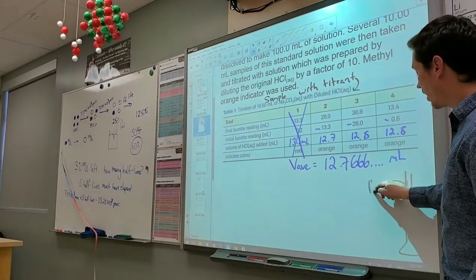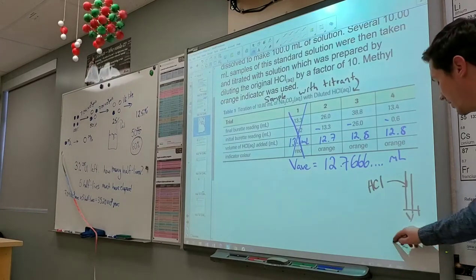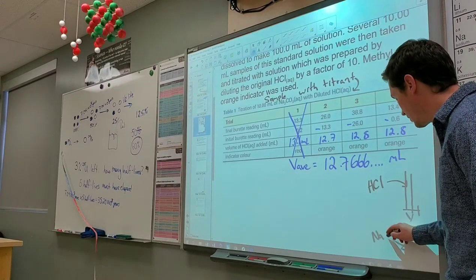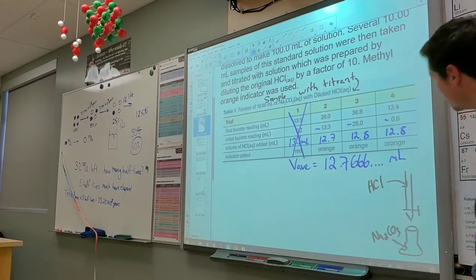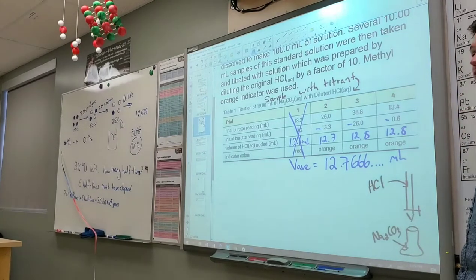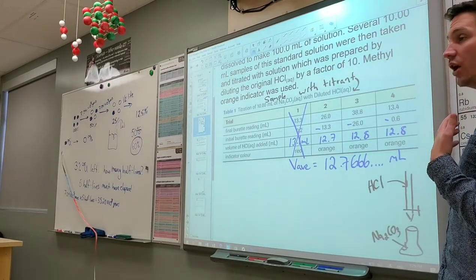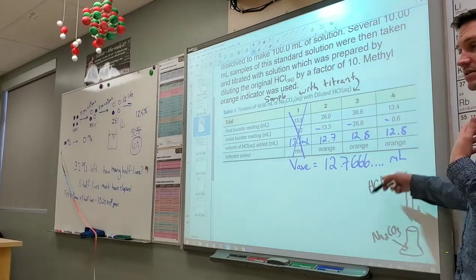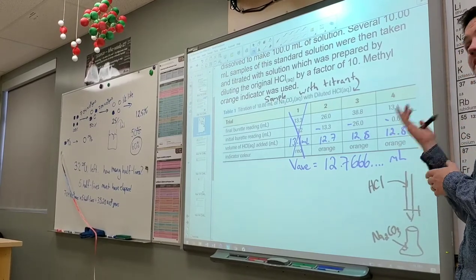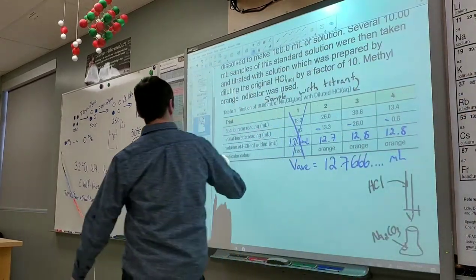So we've got hydrochloric acid up in the burette, and what substance do we have in the Erlenmeyer flask? We've got our sodium carbonate. Now I want to be very clear, when you're doing titration, typically you want to know the volume of both of these things, and you want to know the concentration of one of these things. You're trying to find the second concentration.